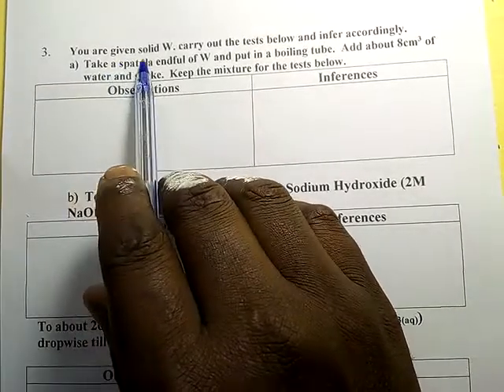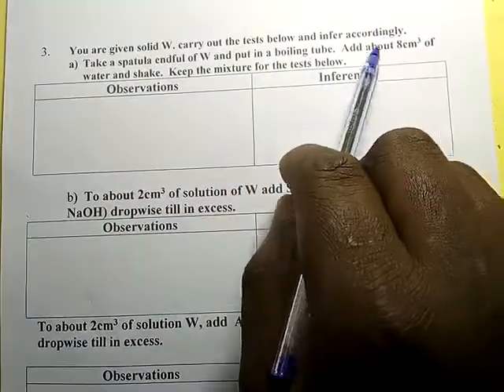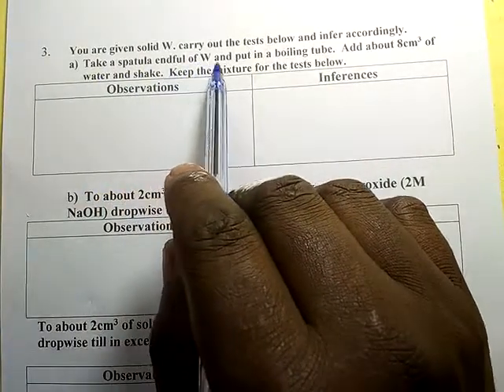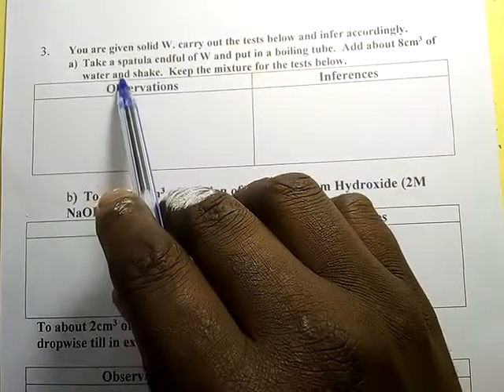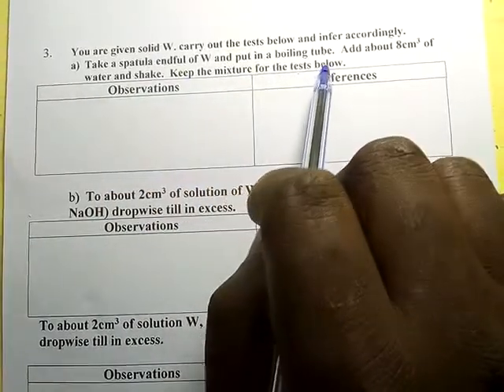You are given solid W, carry out the test below and infer accordingly. Take a spatula end full of W and put in a boiling tube. Add about 8 centimeters cube of water and shake. Keep the mixture for the tests below.